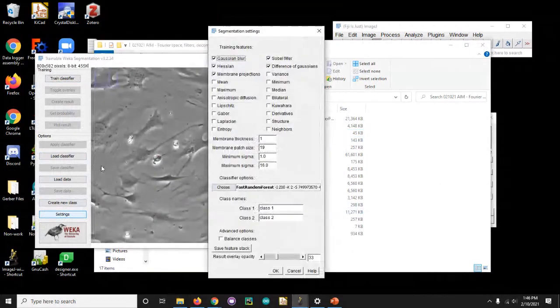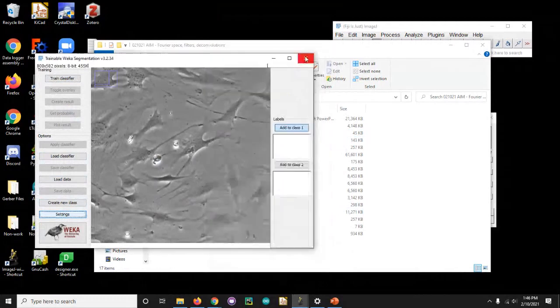But to really understand how to even do adaptive learning, you need to have a sense already of what sort of feature space best delineates your image from the background. So it's not a magic bullet. Instead, you really need to have a strong sense of what's covered here, where you can segment and denoise images most of the time with just basic filters, and you don't need more advanced algorithms.